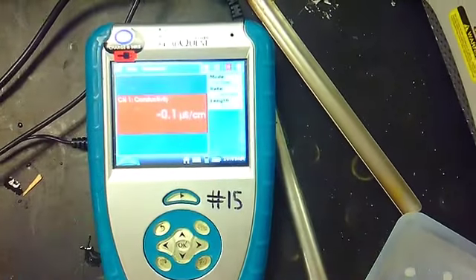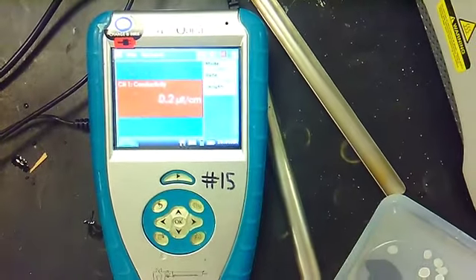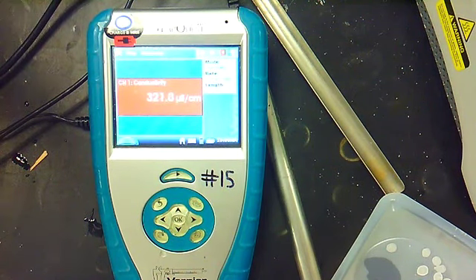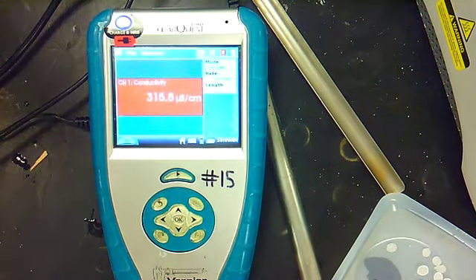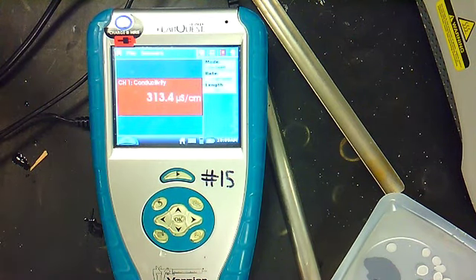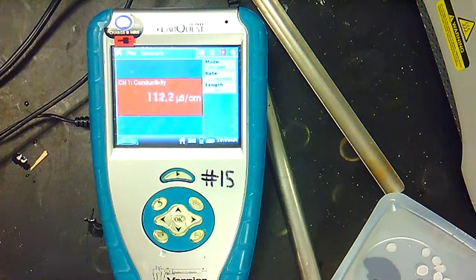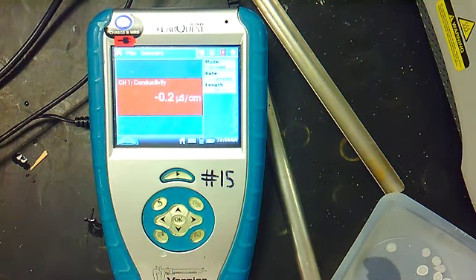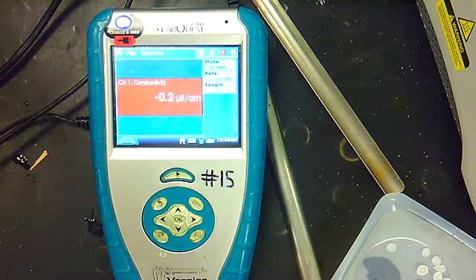So, all right, this is going to be the first compound. Okay, so you want to record that number, approximately. Okay, I took it out of the water. Since it still has that compound on it, it's still conducting a little bit. All right, and I rinsed it out and zeroed it out. All right, the second compound.